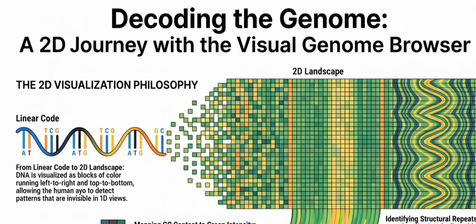It's amazing. It isolates your target within its macrospatial context, but the true power of the system emerges when you move beyond simple name searches and begin utilizing operators. You mean like the exclusion tools, the minus operator? Exactly. Consider the physical structure of the DNA double helix. It consists of two complementary strands running in opposite directions, a positive strand and a negative strand. Right, they run parallel but opposite. Yeah, and genes can reside on and be read from either of these strands. So if a researcher is solely focused on the positive strand, viewing the negative strand data is simply a distraction.